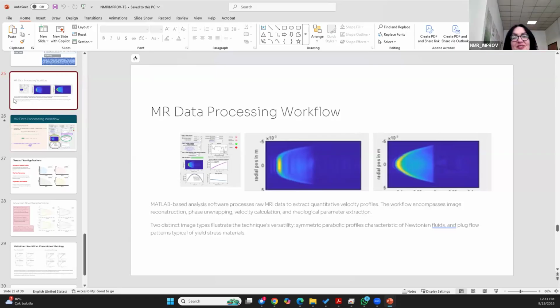More questions? Mecit, who produces this equipment and how much does it cost? We bought it like 3-4 years ago, I guess. Pure Device, a small company in Germany.